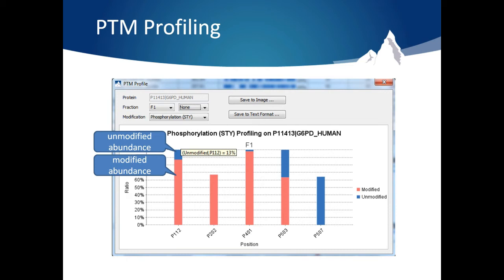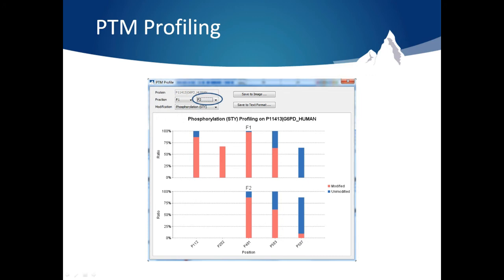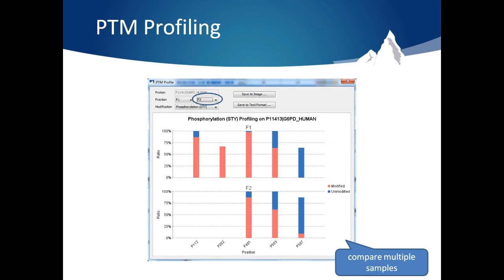Scrolling over the graph will give the percentage of the total amount. You can also use the drop-down menus at the top of the window to compare the phosphorylation ratios across multiple runs. Here you can see at some positions there is consistency across runs. At other positions, the modification didn't appear. So you can see the similarities and differences in modifications across multiple runs. You can also export the PTM profiling data to get more details.